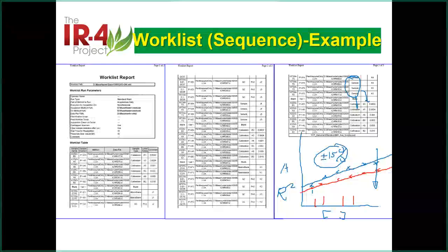If the difference is too high, bigger than 15%, or your recovery will change significantly, then it's different. Okay, of course, if it is within this range, your recovery should be in a certain range. So which number should you use? Should you use the first line or the second line? So that's always the question.